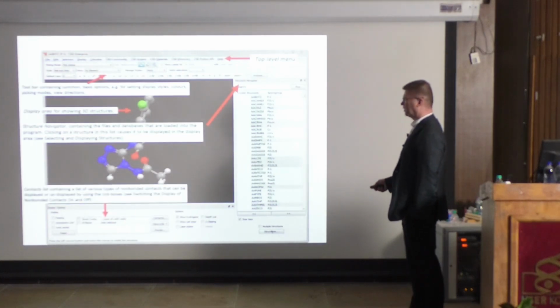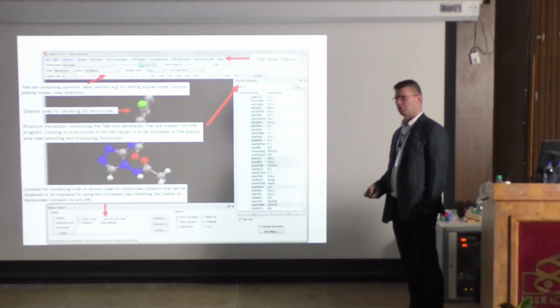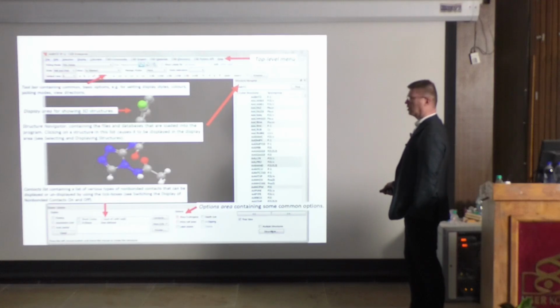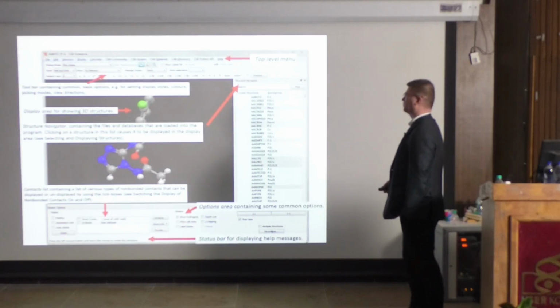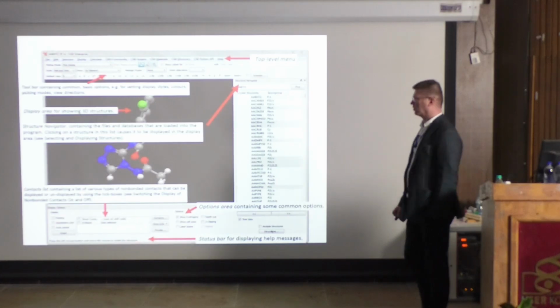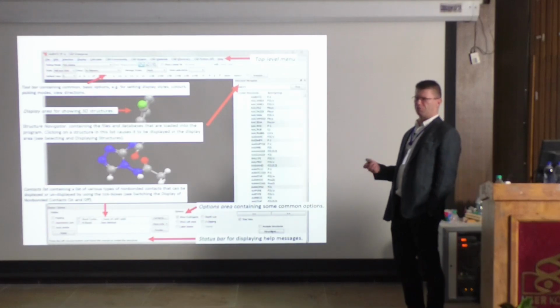And here we have these contacts menu buttons, which easily show the other molecules. I will demonstrate that soon. And here we can also exclude hydrogens and this kind of thing. This is a little bit that, by doing, you learn how it works. And status bar texts can give you some help messages. So it's very intuitive. It's a very easy program to use.